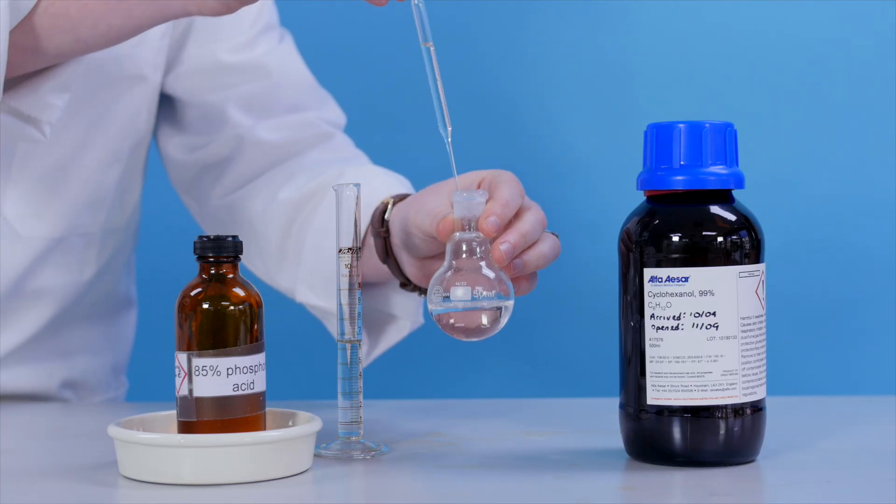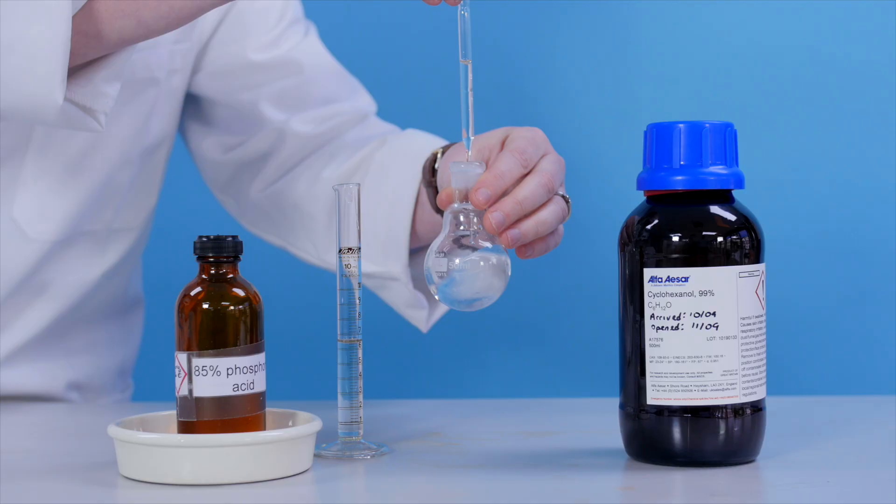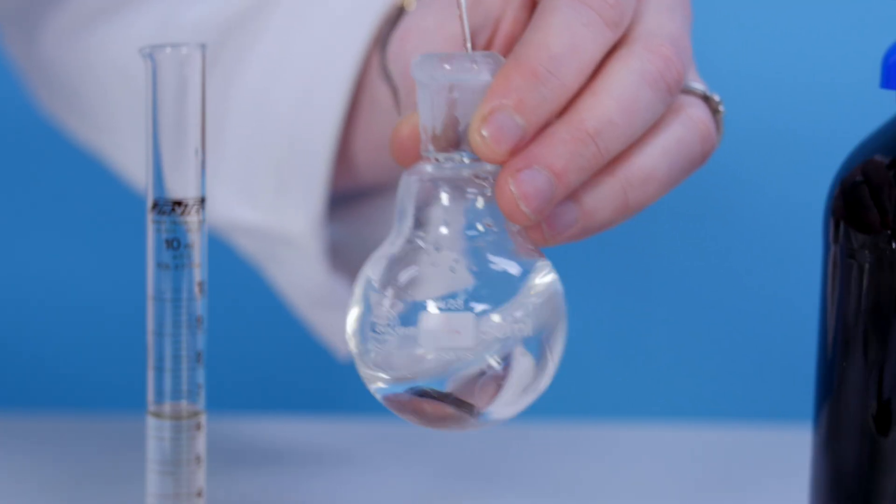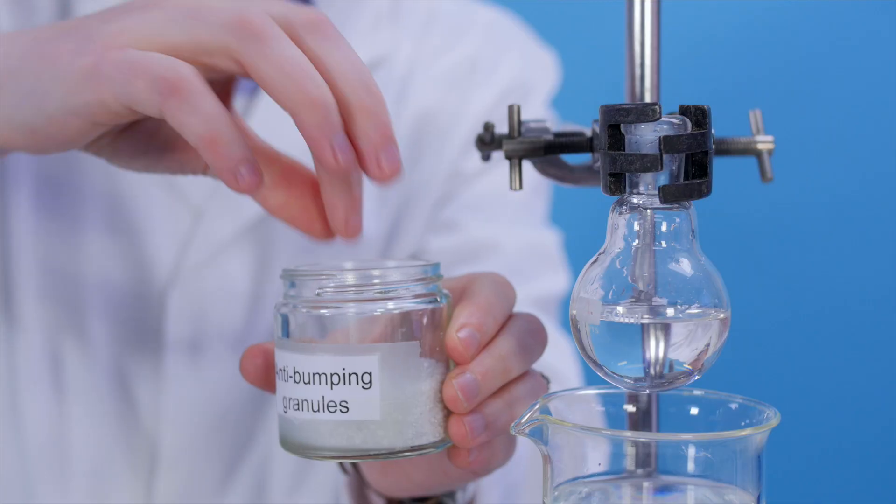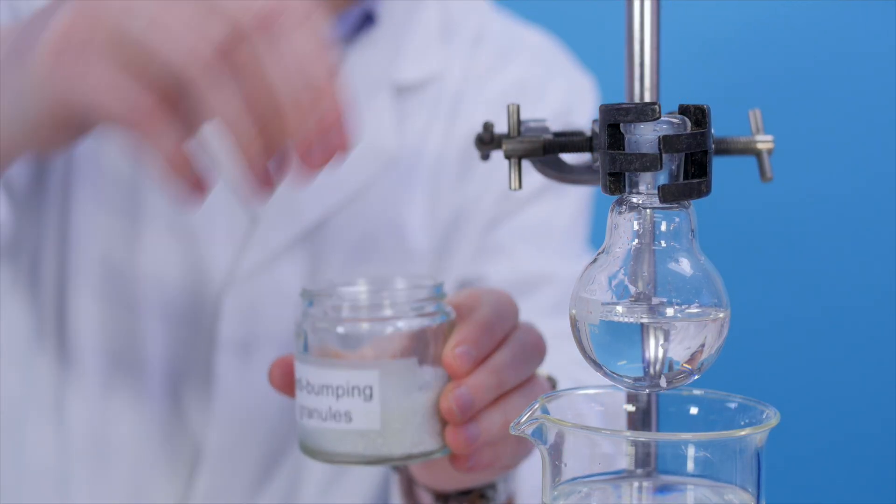Add 8 cm³ of concentrated phosphoric acid drop by drop to 20 cm³ of cyclohexanol. Swirl the mixture while adding the acid. Support the flask with a clamp and then add a few anti-bumping granules.